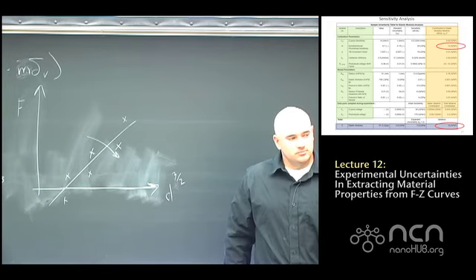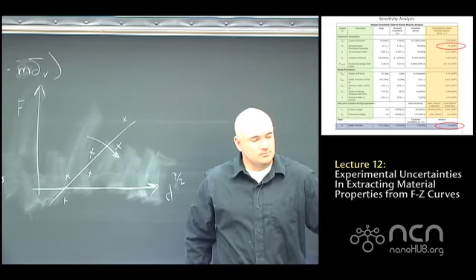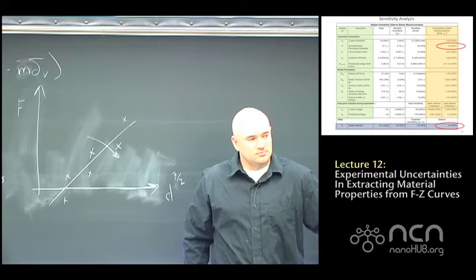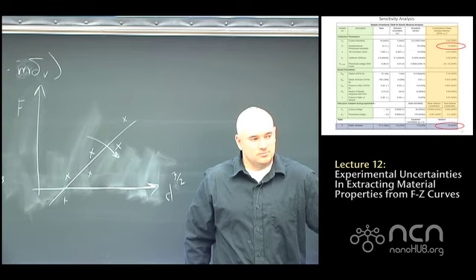Z is in tens of nanometers, delta can be tens of nanometers. So you're subtracting two rather large quantities, and you're trying to get an indentation, which in this case may be 1 nanometer at most, or half a nanometer. So the uncertainty comes from that primarily, because if you haven't done your volts to nanometer conversion accurately, it just feeds all this uncertainty into your final answer for the elastic modulus.